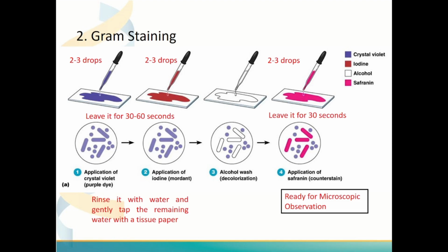And then the second picture showed us that we have to add two to three drops of Lugol solution or iodine solution on the smear for at least 60 seconds, as we can see from the second picture in this presentation. And again, we have to tilt and rinse it with water and gently tap the remaining water with a tissue paper.